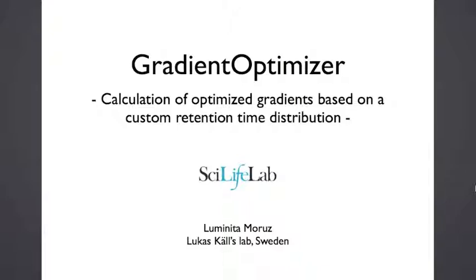What I'm going to talk to you about in this tutorial is how you can use our new tool called GradientOptimizer to calculate an optimized gradient based on a custom retention time distribution.